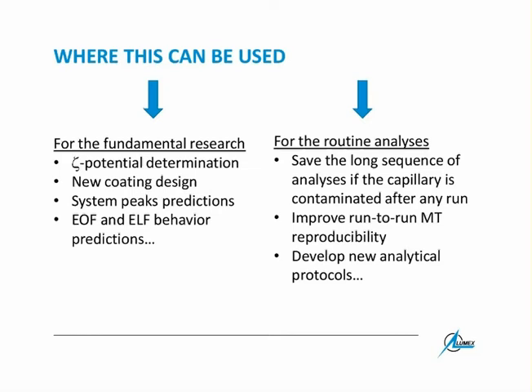If you measure streaming potential, you immediately see whether it is still equal to 0, as it should be in coated capillaries which eliminate electroosmotic flow, or it is now more than 0, or less than 0 if it is negative. Thus you understand whether the coating is slowly degrading.